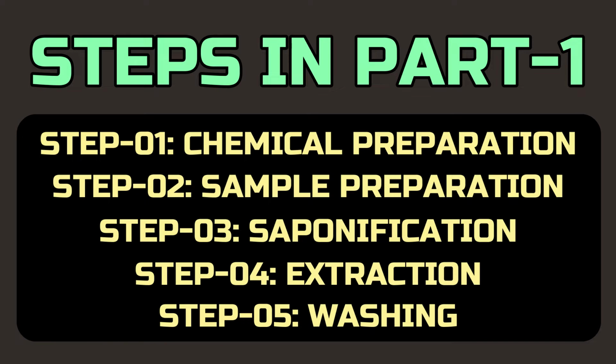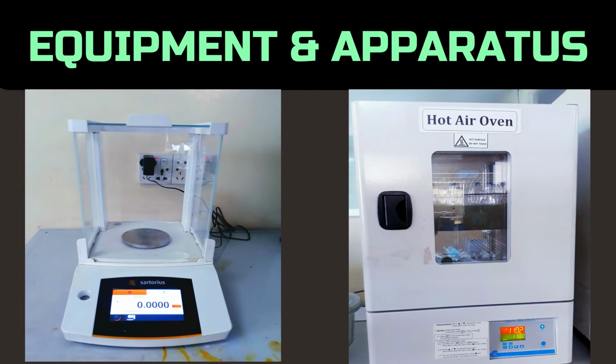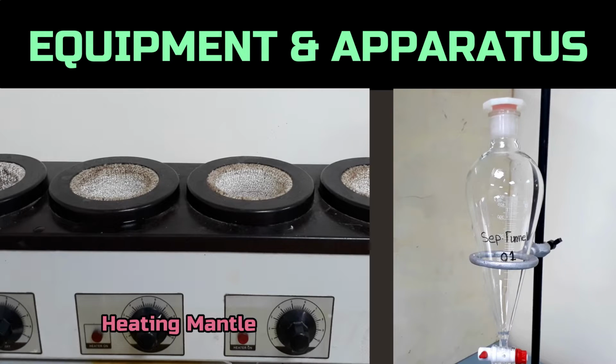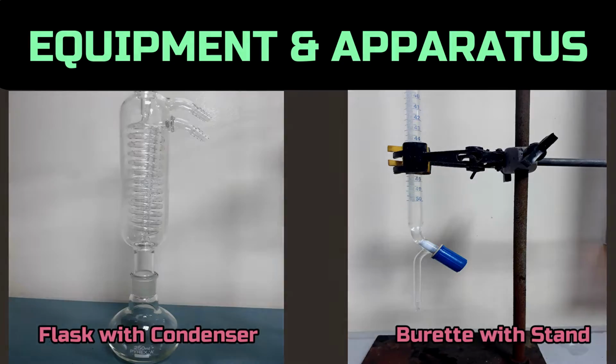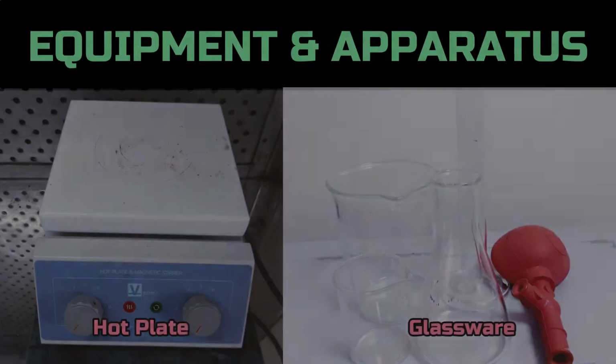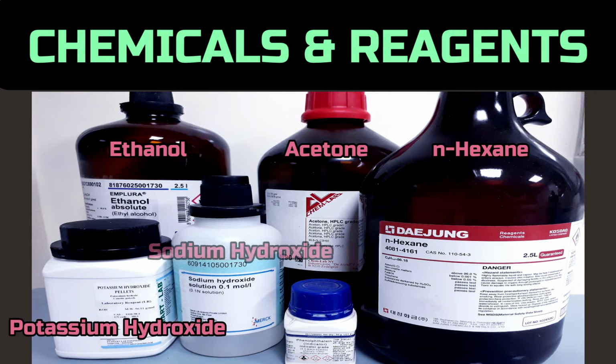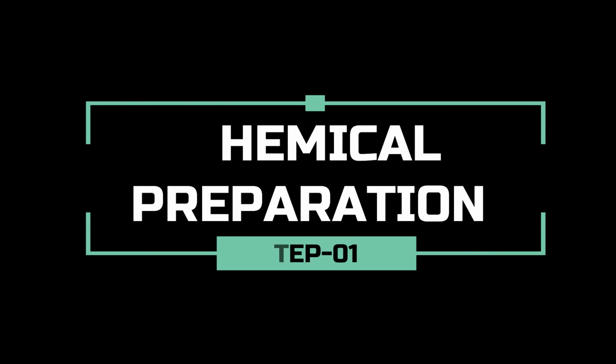This video covers chemical preparation, sample preparation, saponification, extraction, and washing. To carry out the whole test, we need a balance machine, hot air oven, heating mantle, separating funnel, flask with condenser, burette with stand, hot plate, glassware, n-hexane, ethanol, acetone, potassium hydroxide, sodium hydroxide, and phenolphthalein. First step is all about the chemical preparation.